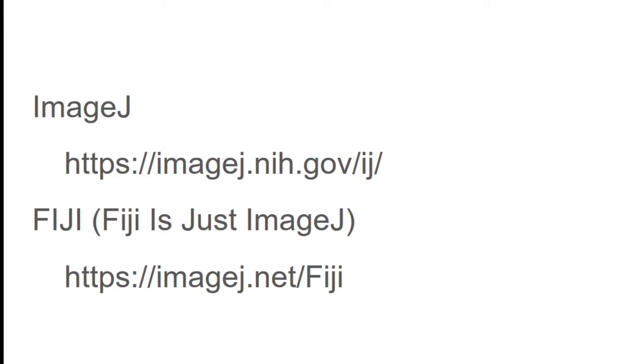You can use it for all sorts of purposes. It doesn't cost anything, which is really, really nice because it's a really useful program that you can use in a lot of scientific endeavors. So I hope that as you follow through this video, you'll see a little bit of how flexible it is. It can do so much more than what you're going to see.